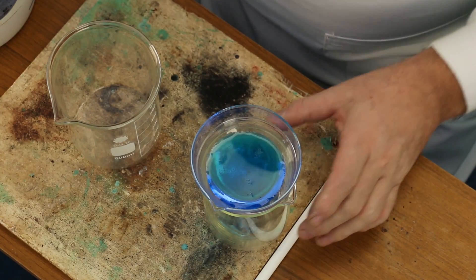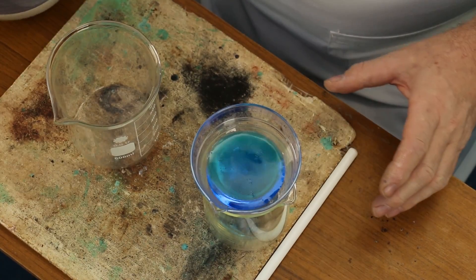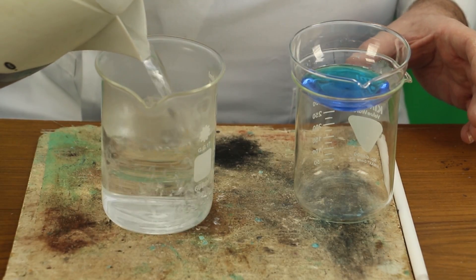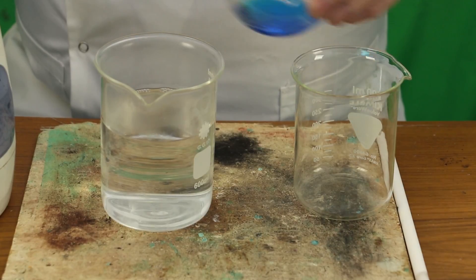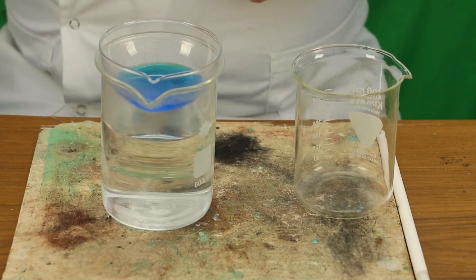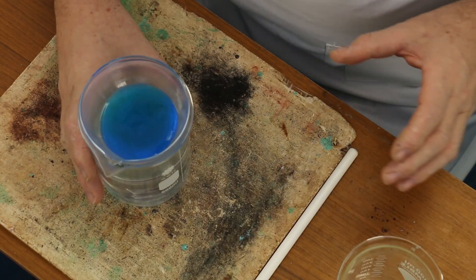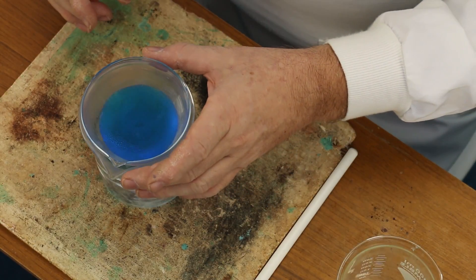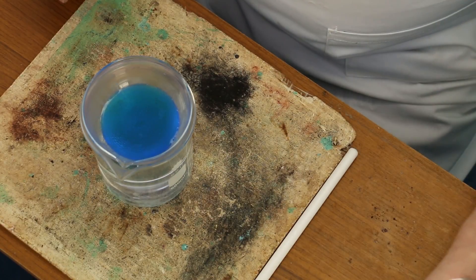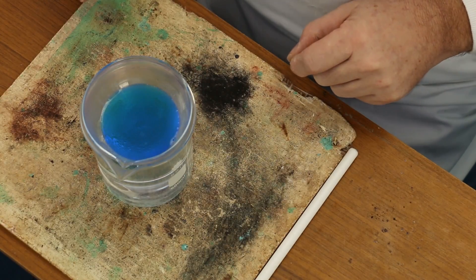Now we've managed to filter our solution. What we're going to do is put some boiling water into a beaker and place this over the top. That is going to very gently warm the copper sulphate and allow the water to evaporate. We don't want it to evaporate too quickly because we want to get very nice crystals of copper sulphate.